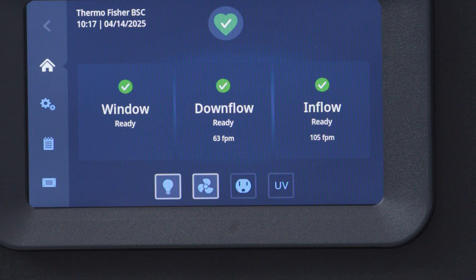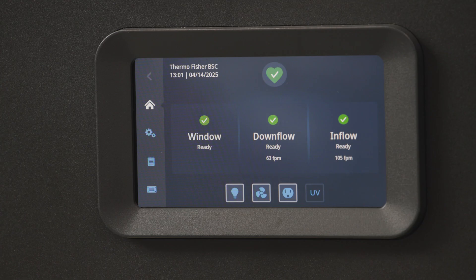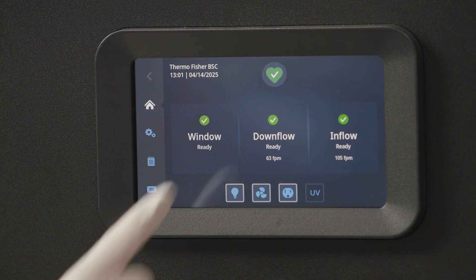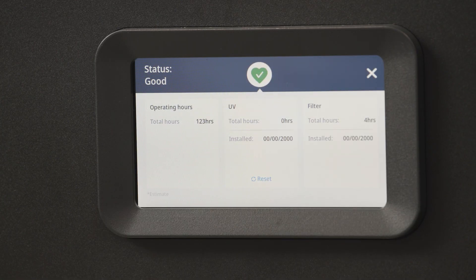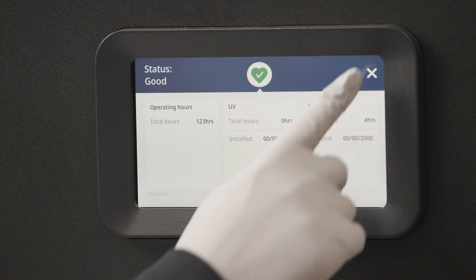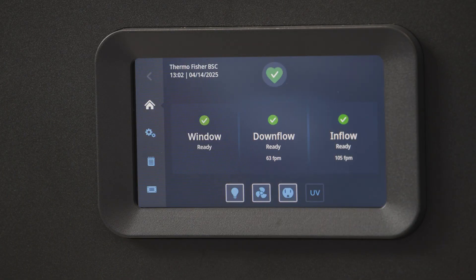If you want to see the overall system status, look at the green heart at the top of the screen. If you need more detail, touch the heart to see the total cabinet operating hours, UV hours, and filter hours. To return to the home screen, touch the X.